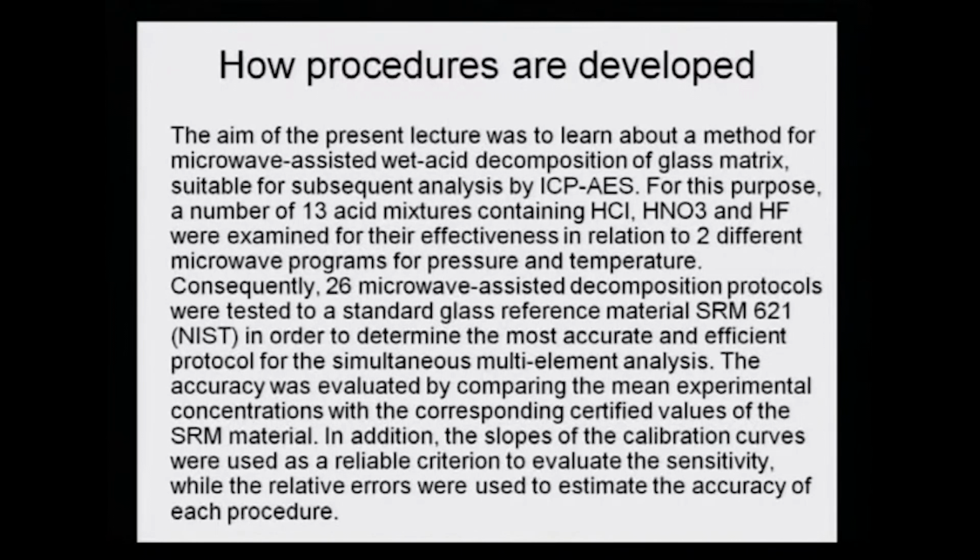So, the design of the microwave method is now elaborated. You will see that two different programs were conducted in microwave analysis, just the way we have cooking recipes. We cook dal in many ways, and sambar is made in another way, and some other dish is made in a third way. Similarly, we have microwave assisted programmed techniques for digestion, so that we see which one is better. In the case of food, it is the taste which matters, but in this case it is the best dissolution of all the components which matters. I am giving you this day to day life example only to be able to correlate, although dal has nothing to do with microwave digestion of silicate samples.